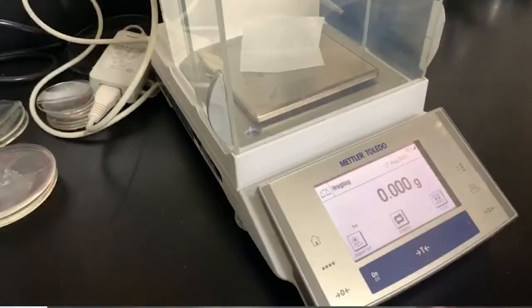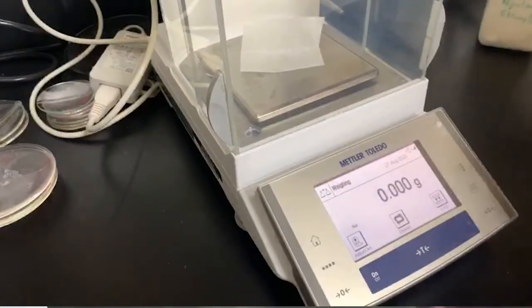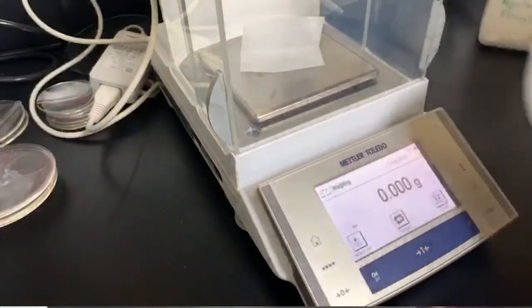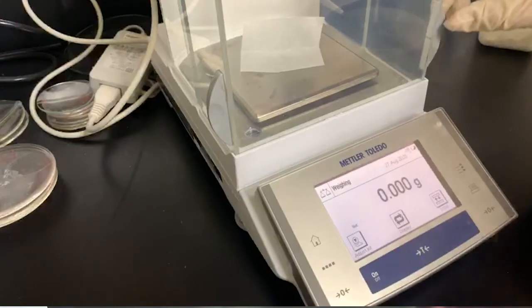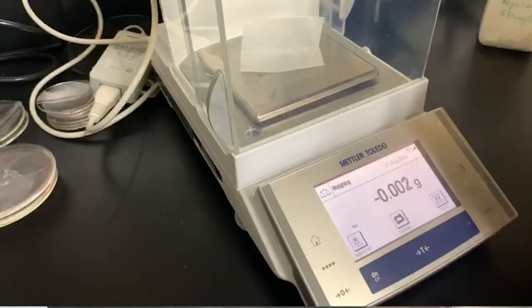Alright, so what we've done is we have ground up one of these regular Tums tablets using our mortar and pestle. And we're going to measure 2 samples of approximately 0.4 grams each. So this is our first one.